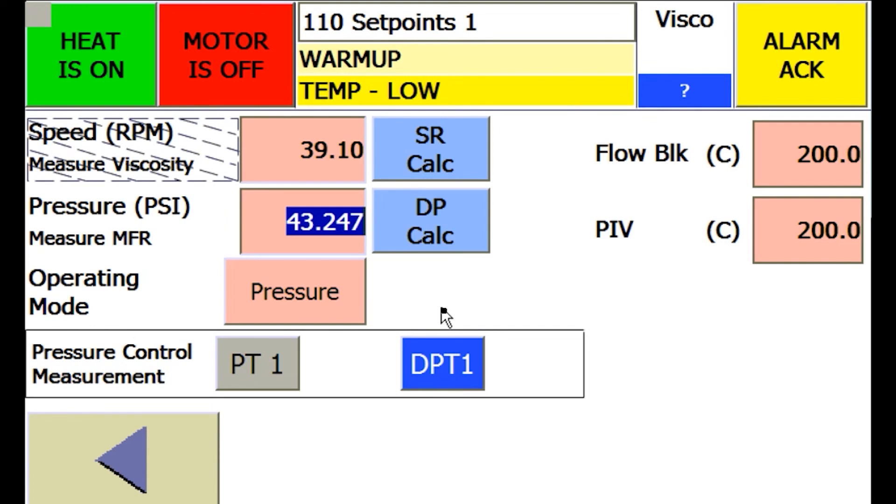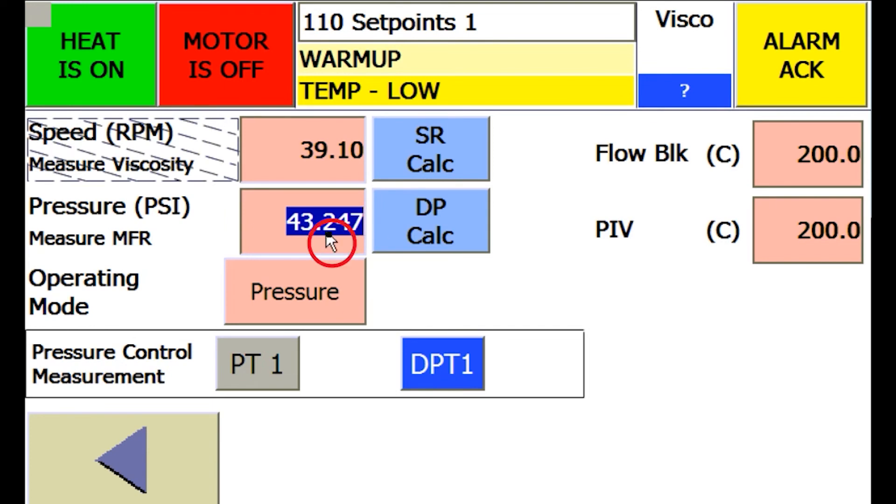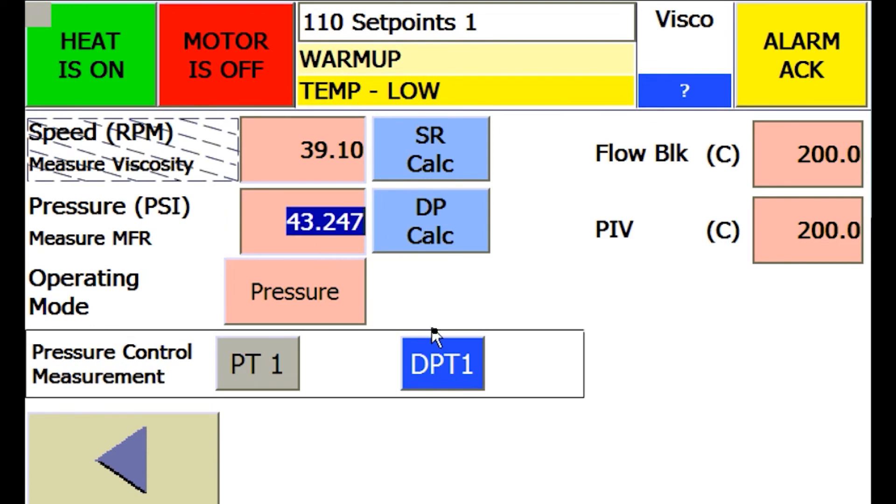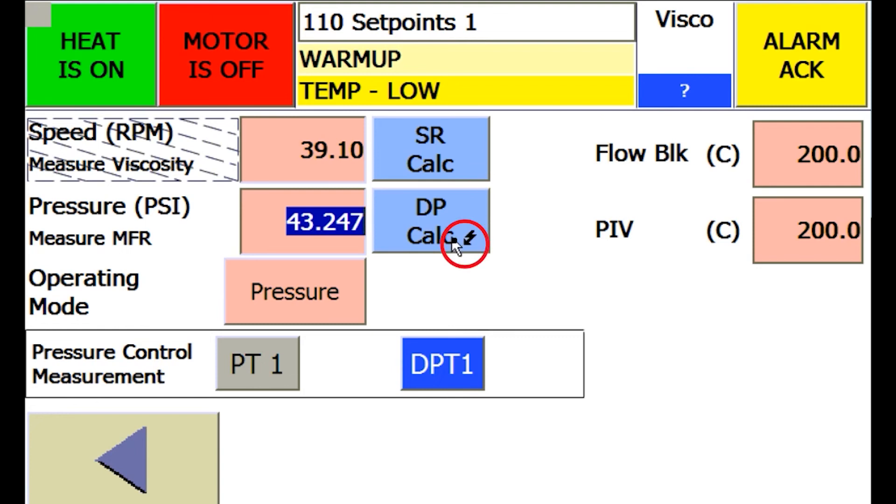Speed and pressure set points can be directly entered, just as with the temperature set points. To set either a speed set point in terms of shear rate or a pressure set point in terms of shear stress, use the appropriate SR calc or DP calc buttons next to the set points.